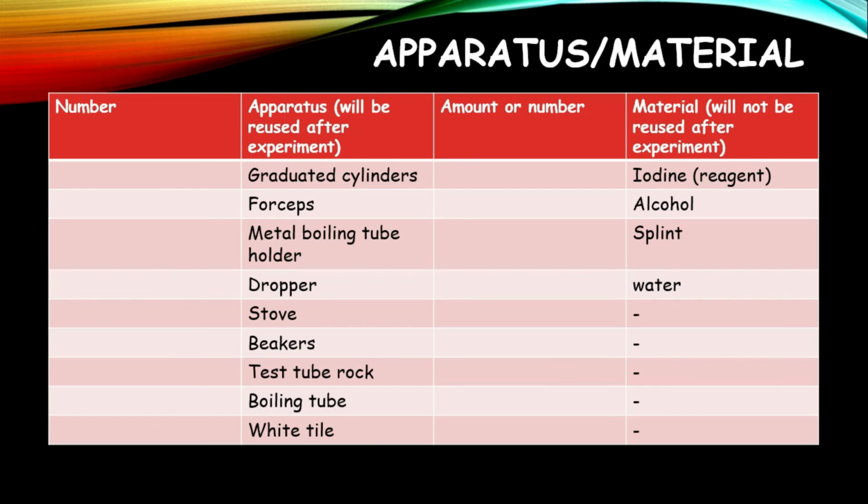For example, if you look at reagent, like iodine, once it is used, we are just going to throw it away. So what we put on the leaf, or what we use to stain that cell that we're looking at, the organelles, we are not going to be collecting that iodine again. And once it's contaminated, we use it. We really don't use it again. The alcohol, to some extent, once used, you know that we're going to immerse the leaf in the alcohol, and then it's going to be disposed of.